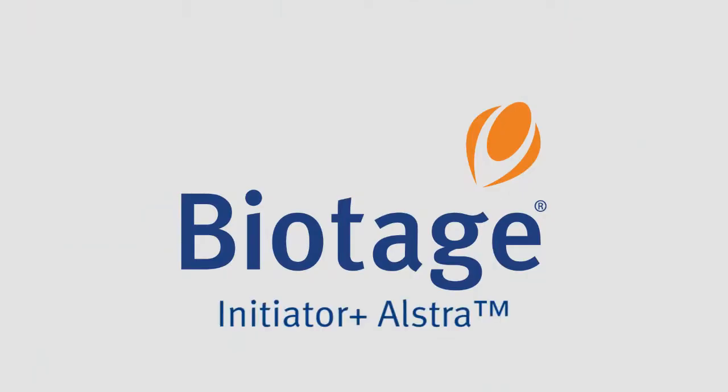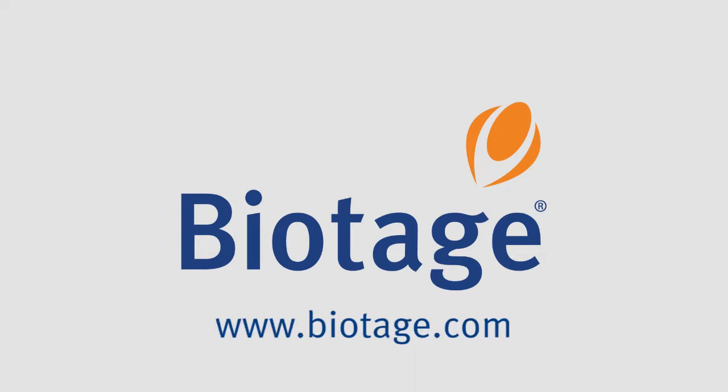For smarter microwave peptide synthesis with the Initiator Alstra, visit biotage.com for more information.